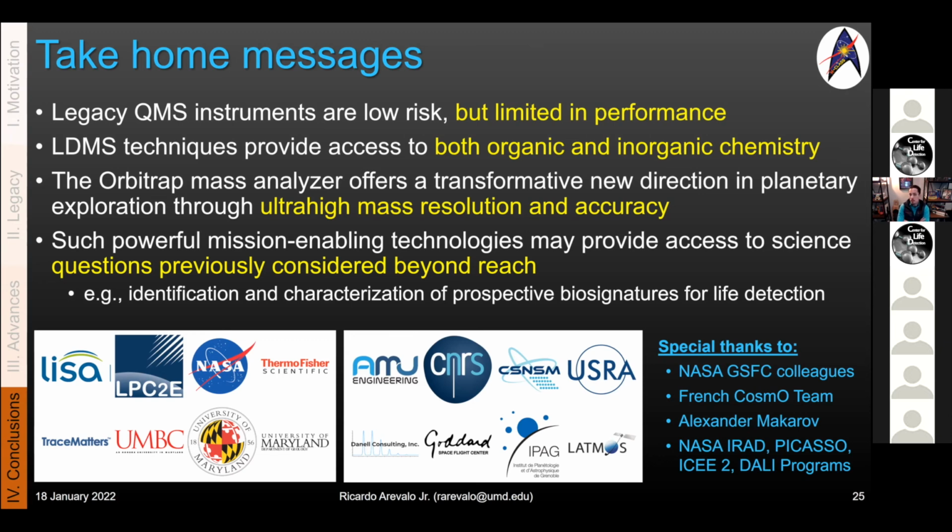that's TBD. I have a new postdoc in my group, and we've been interested for a long time in exploring the quantitative capabilities of just a laser source with nothing else on it, no plasma source. I'll be curious to understand what our reproducibility for elemental abundances is, because with lasers, for 30 years, we're well aware that lasers incur elemental fractionation. Can we calibrate for that with LDMS techniques, and how well is TBD.